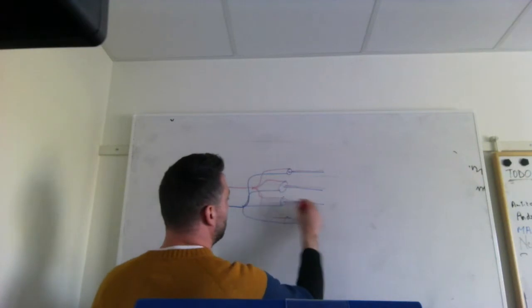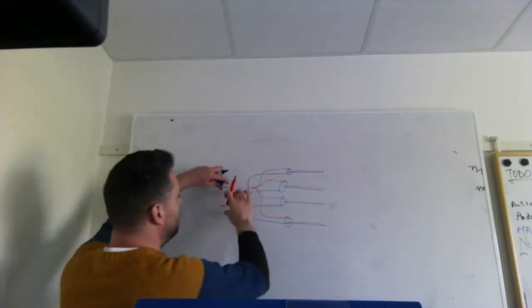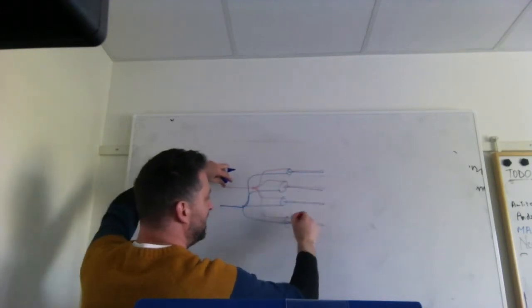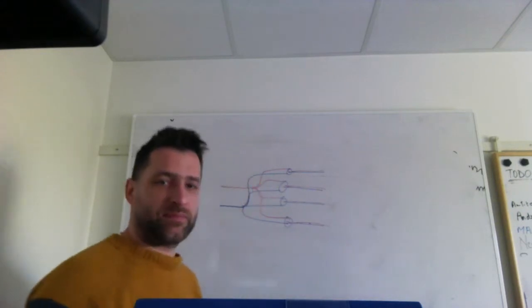Here I get red and blue here and here. So what I'm doing actually is, instead of having two streams and bringing the two together, I split them, and then I have in this case 4 regions with interface area. So I go from 0 interface to actually 4 different streams with 4 different interface areas where I have diffusion. And this is how the mixer works.